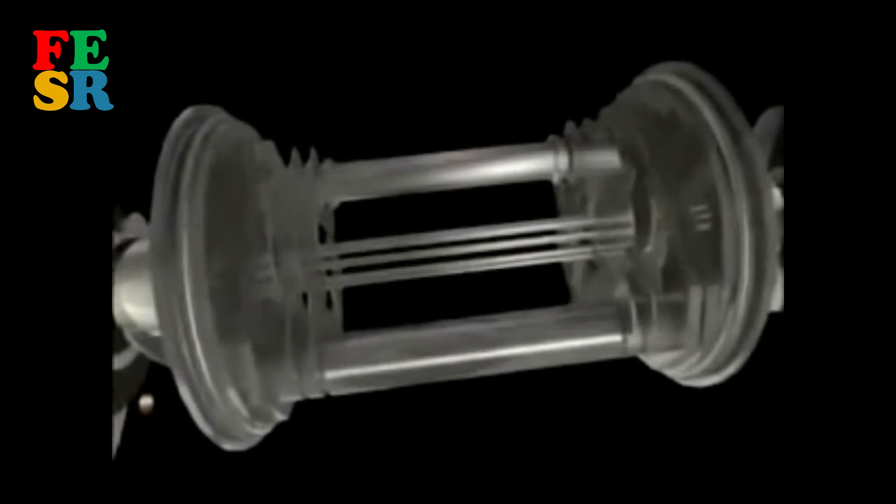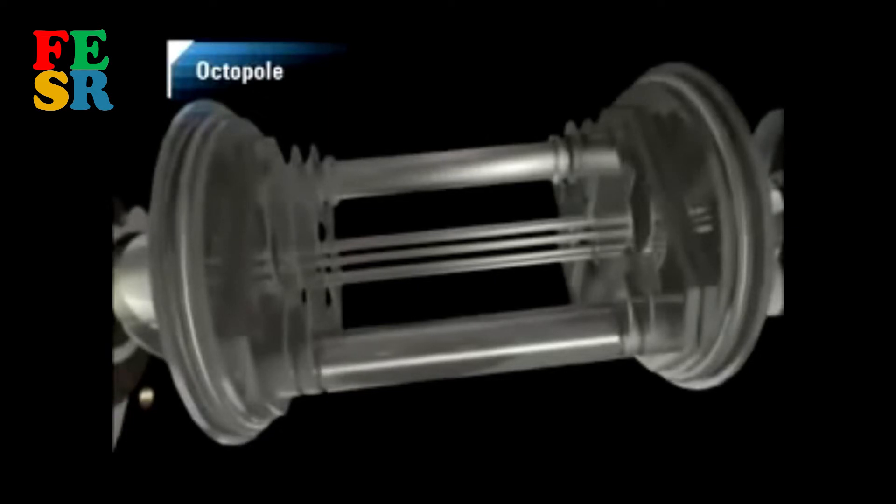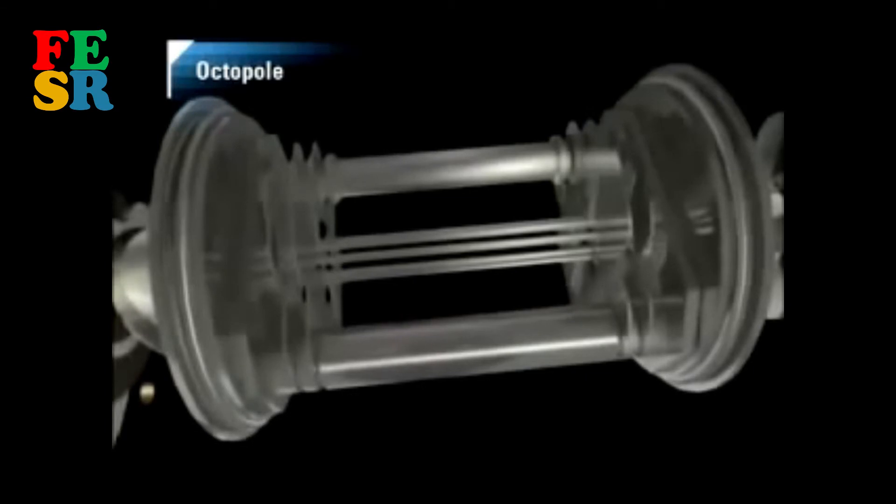The ORS is unique in using an octopole ion guide in the cell rather than the hexapoles and quadrupoles used in other cell ICP-MS systems. Octopoles are small, reducing the size of the cell and allowing operation at higher pressure relative to other systems.